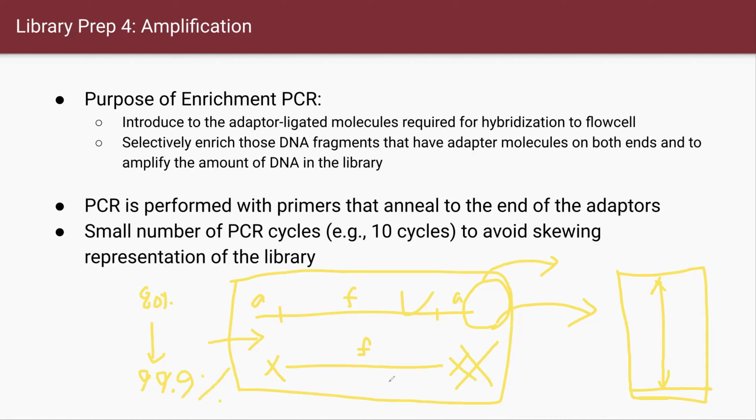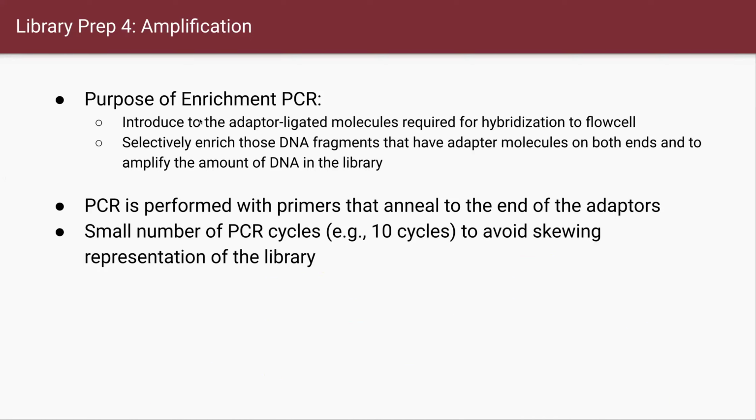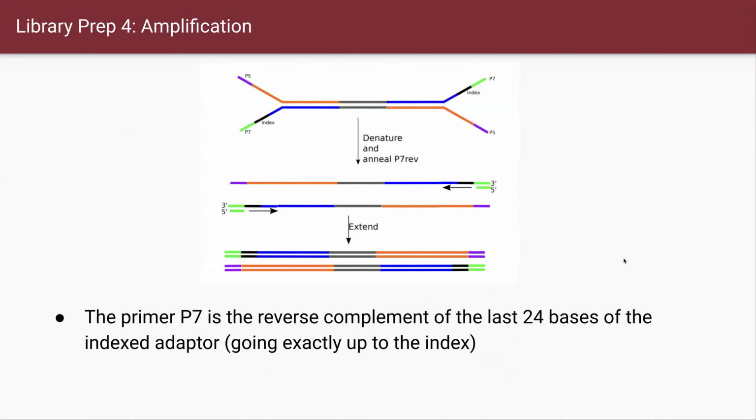And this is true, right? So these days, kits are quite advanced, improved over time. So efficiency is nearly 100%, right? So you don't really require PCR enrichment. But just for your reference, and also for a slightly different library preparation, not like genome sequencing or RNA sequencing, some of the libraries, like epigenome, we still require the PCR enrichment. So I briefly mentioned this process in this lecture.